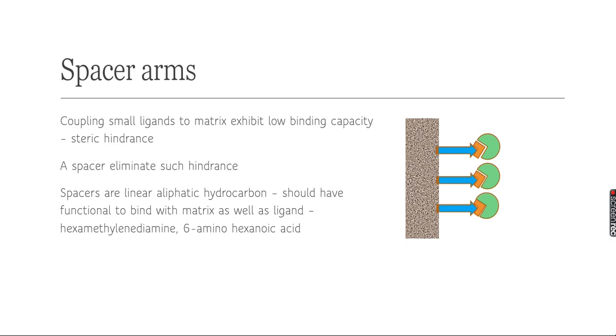Most of the time the spacer can be a linear aliphatic hydrocarbon chain, and it should have some hydrophilic groups as well.